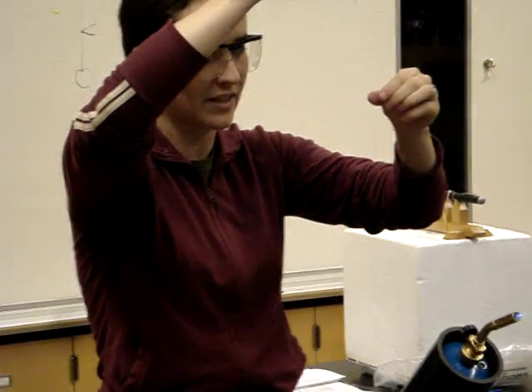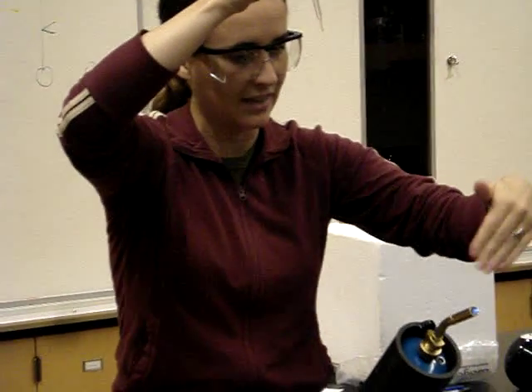And now when you feed this in, this is kind of the tricky part because it wants to swing around once it hits the flame. So go as close to the source as possible so there's less air turbulence going in there.